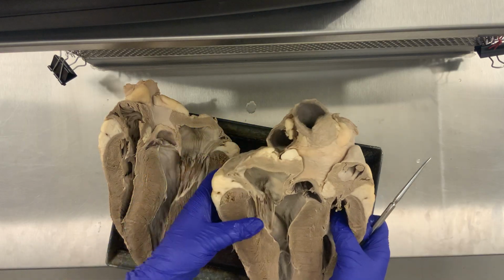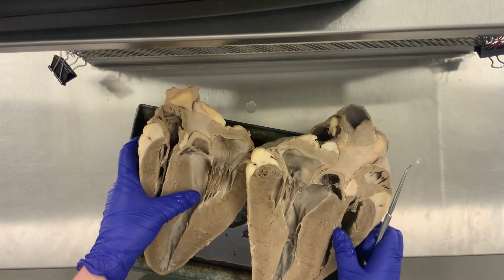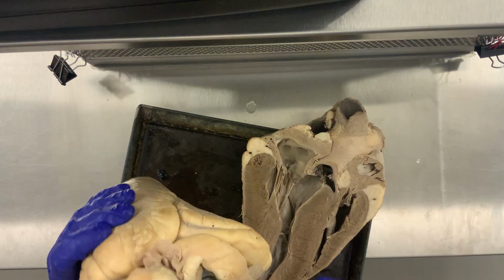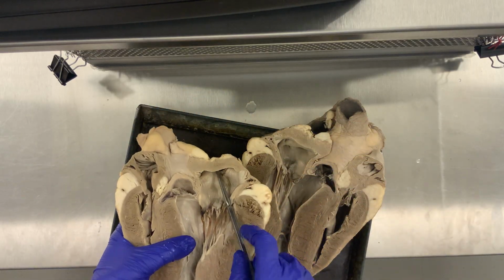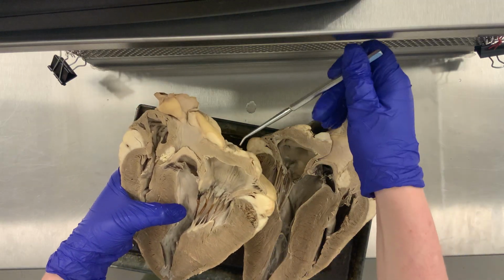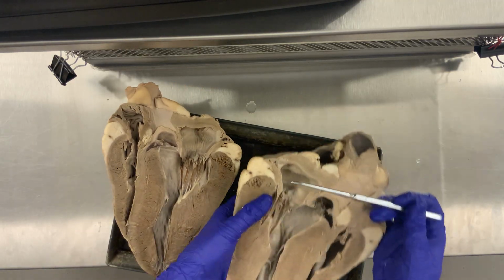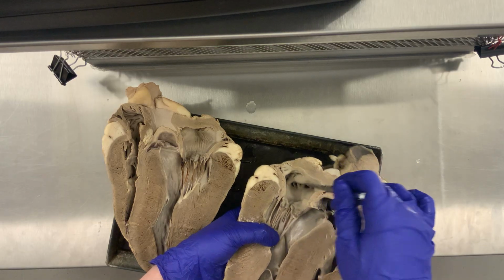So now that the blood is in the lungs, it needs to come back into the left atrium, and it's going to come in through these pulmonary veins. It's been quite severed here as well, but you can still see the opening for the pulmonary veins to bring the newly oxygenated blood into the left atrium. You can see that this one is a little bit less textured. It doesn't have as much pectinate tissue. However, you can see it on this side, on the anterior side of the left atrium.